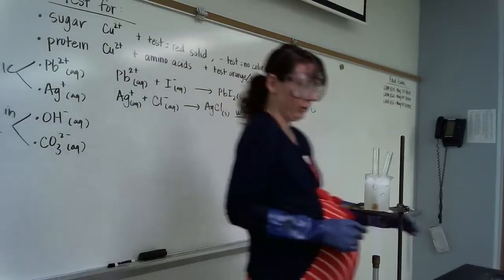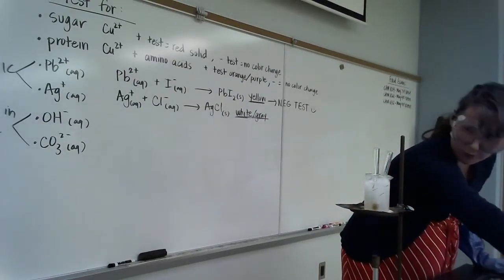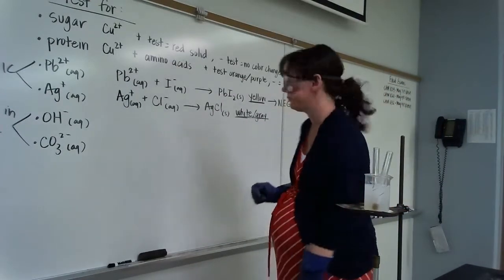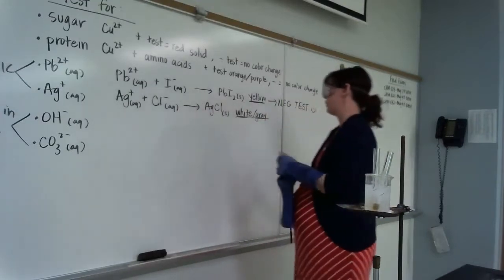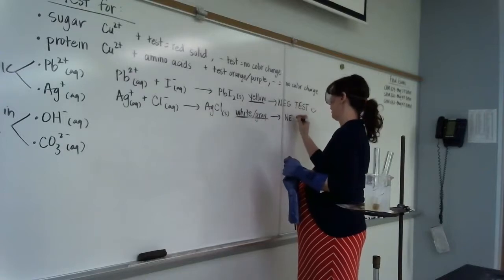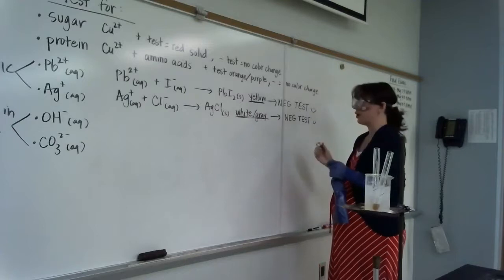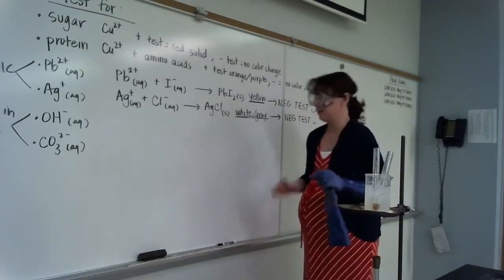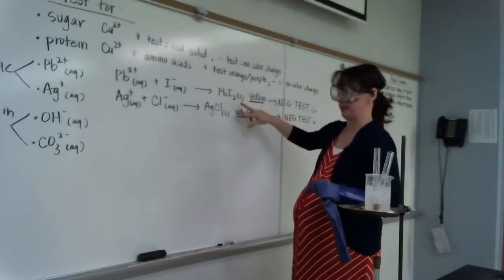All right, we've got boiling here. So I'm going to turn my heat off. There's enough radiant heat in there for that to continue being heated. This was a negative test as well. Whew, good. I will report to the president of the college that we have no lead ions, we have no silver ions, dissolved in our drainage pond. Yay! All right, both negatives.